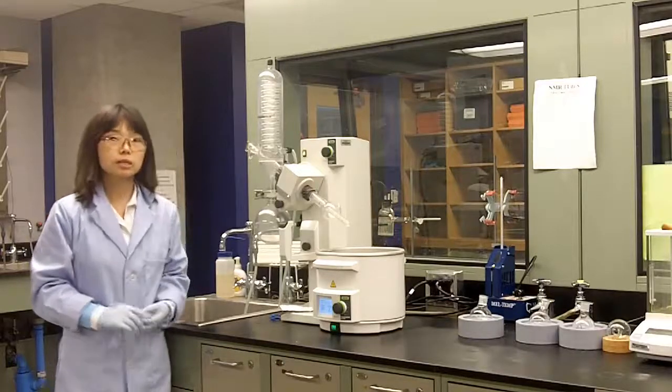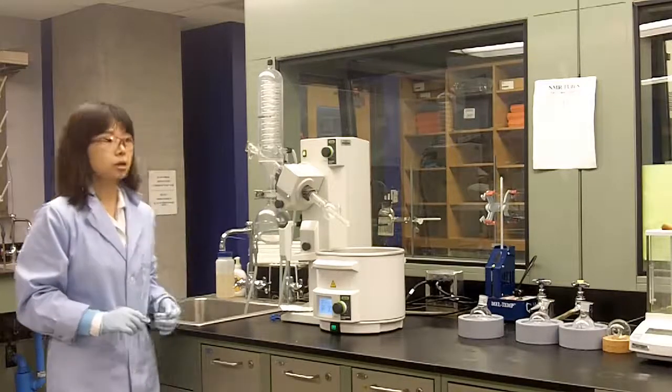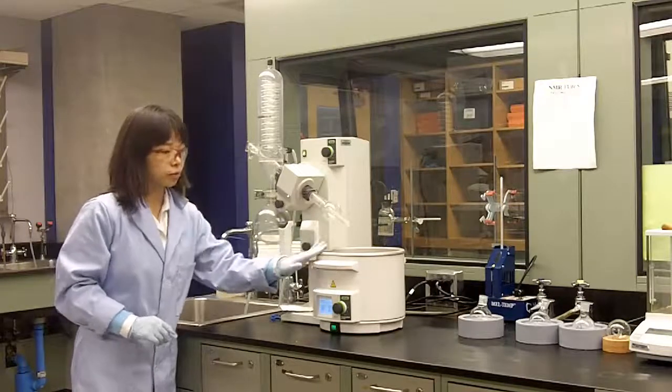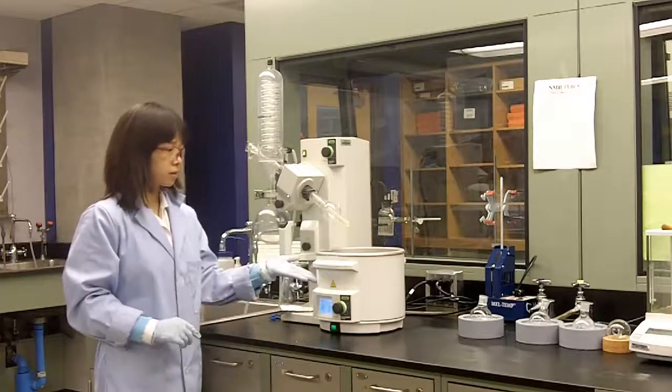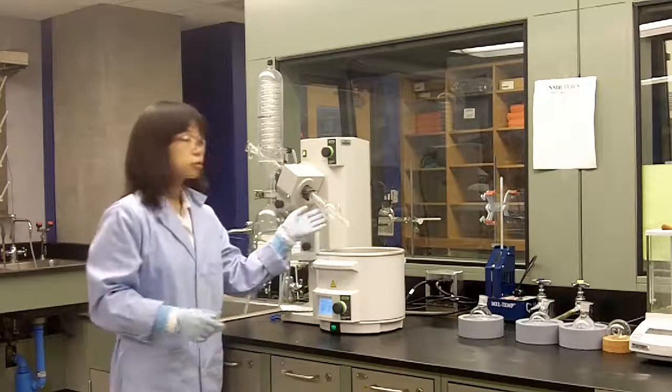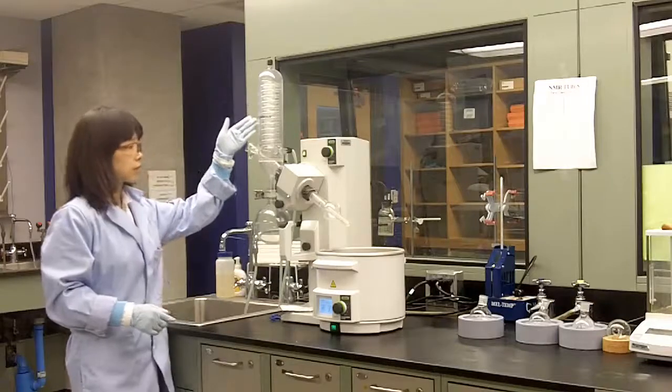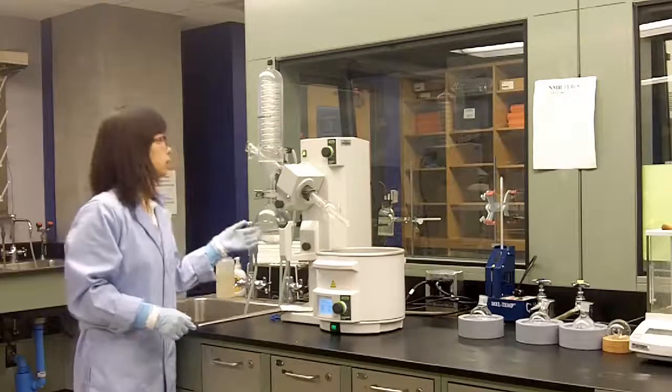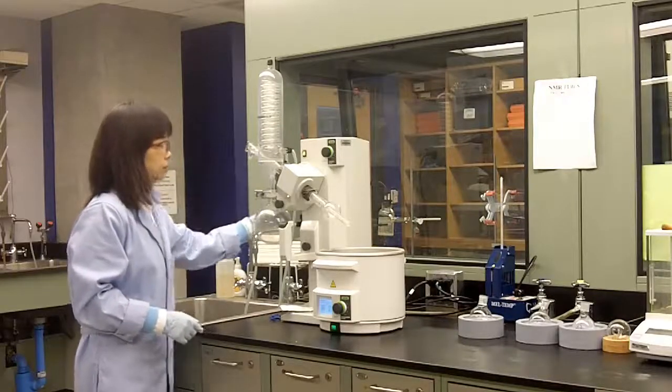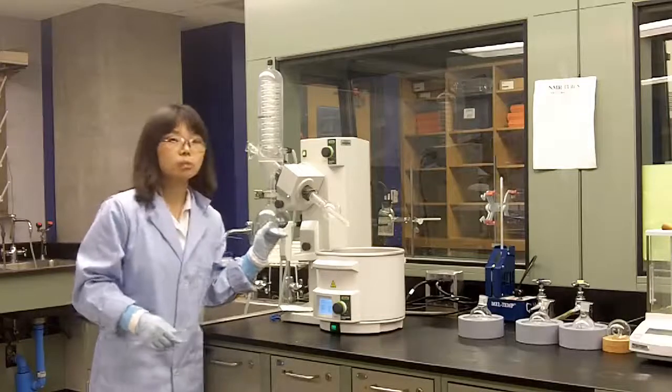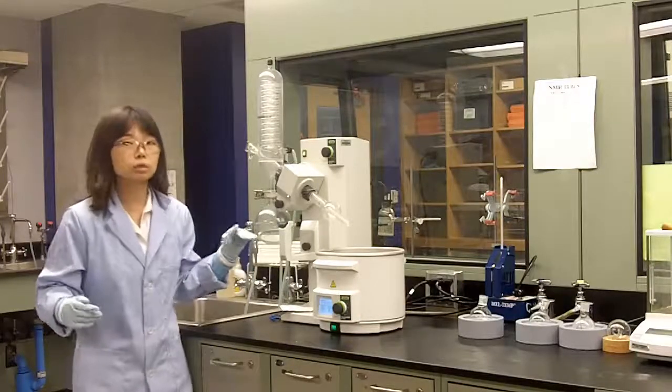Rotary evaporation is designed to remove large amounts of solvents. The principal components include a warm water bath to provide heat to your solvent, a pump trap, a condenser and receiving flask to cool and collect your solvent, and a vacuum line to provide reduced pressure. Remember, solvent boils at a lower temperature under reduced pressure.